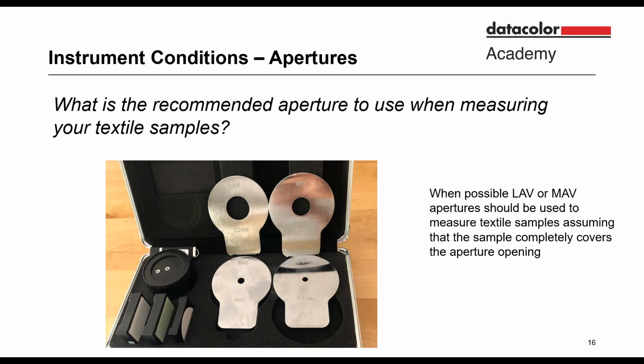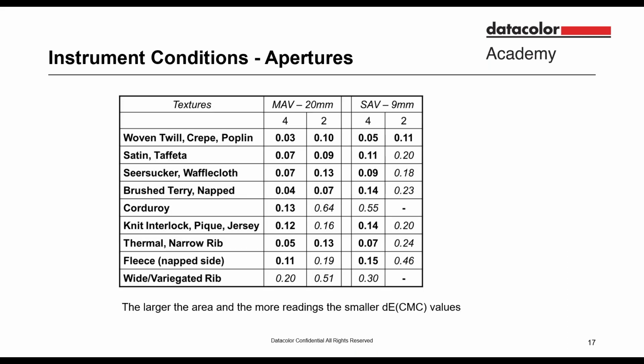But in general, for submission of lab dips, for matching color, or for routine QC activities, the larger the aperture, the better. So we will see many brand programs where the recommendation is to use a medium or a large aperture.